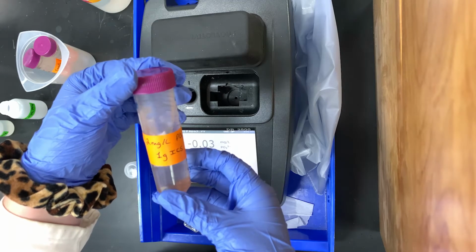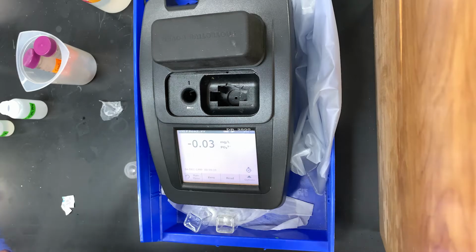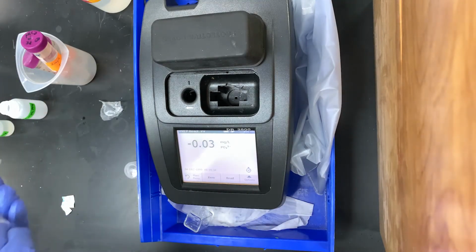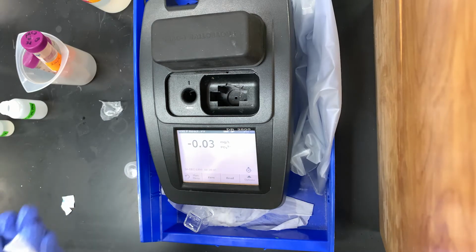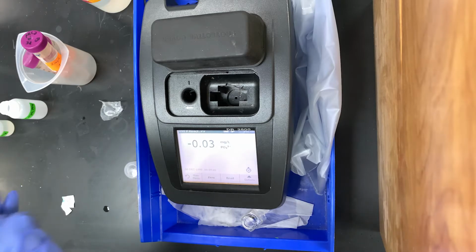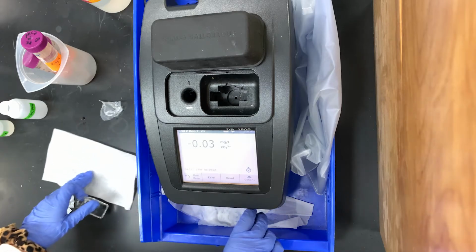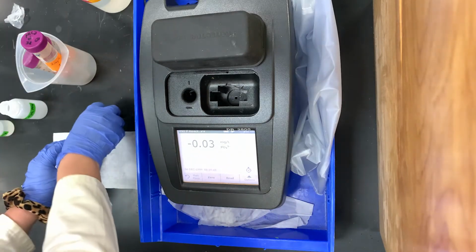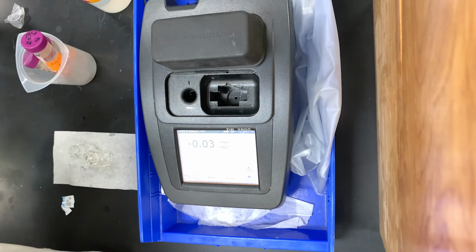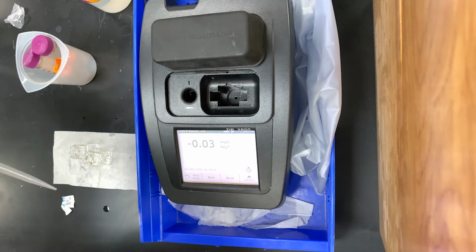So next we'll move on to analyzing the final concentration of our 2 milligram per liter phosphate solution with our 1 gram of iron-coated sand. We have the sand in the bottom there, which you can see was a little bit reddish brown. So again, no dilution needed for the sample as the initial concentration was already below the upper bound of this method. So I'll give these cuvettes a quick dry, and again I'll add 10 milliliters of sample into each one, and just repeat the process with the powder pillow and waiting the 2-minute reaction period.